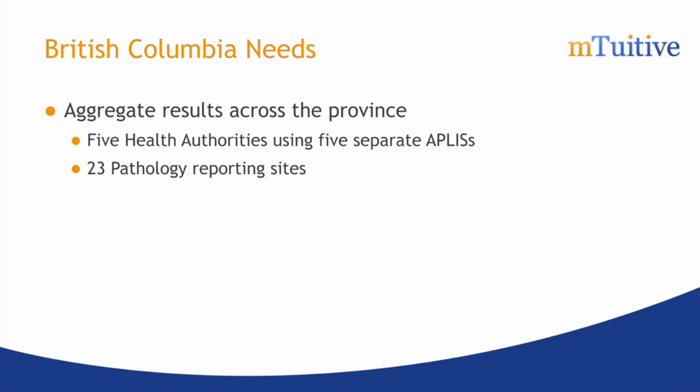So we built those interfaces with the different APLIS systems. We built Insight in a central location, and we supplemented all the synoptic data that they're capturing across those 23 sites with results feeds from each of the APLIS systems into Insight, so that we have a comprehensive view of the patient and their pathology cases in a central location.